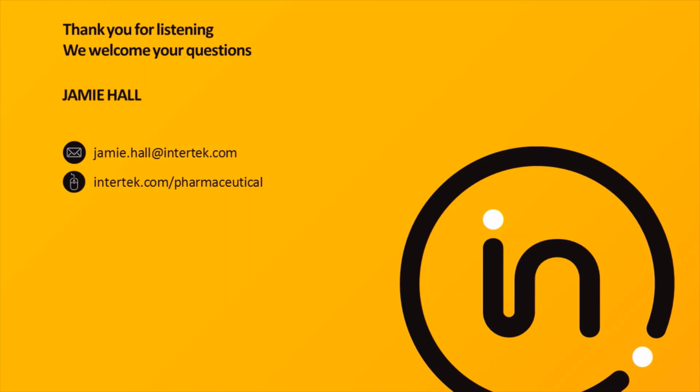Okay. And what data processing software can we use for regulated data analysis? So we currently use the FACS Suite software that is included with the FACSLyric. That's the one provided by BD. We fully validated the system and found that it's perfect for what we use it for, particularly the review and approve functions, which help control the analysis process.